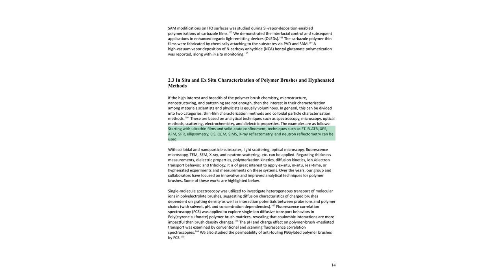Surface plasmon resonance, or SPR, is highly sensitive to changes in the refractive index near a metal surface and is excellent for monitoring binding events or film growth in real time. X-ray and neutron reflectometry can provide detailed information about the density profile of the brush perpendicular to the surface. For brushes on colloidal particles, different techniques are required.